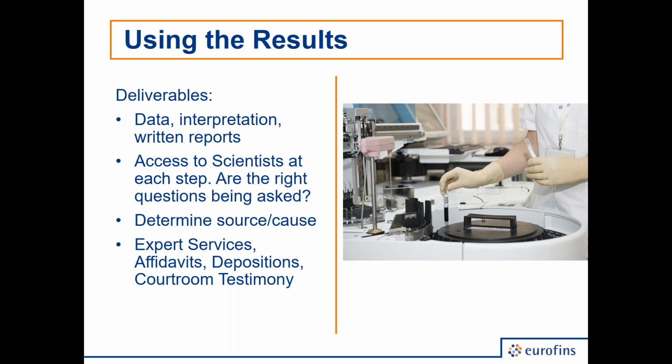And then finally, in cases where something maybe goes to court, there's a vendor claim, a legal claim, insurance claim, will your lab stand behind their findings and sign an affidavit? Will they give a deposition?